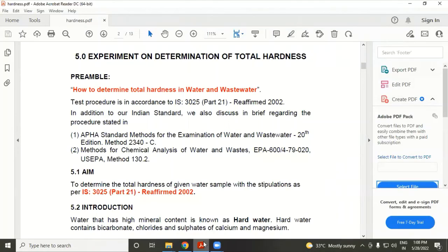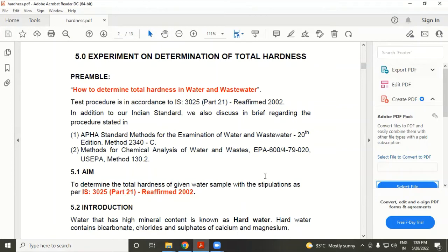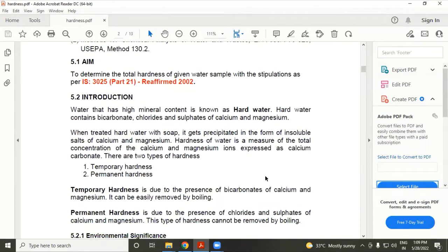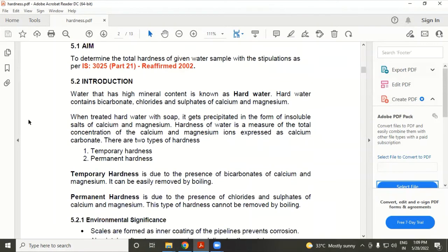Good afternoon students. Today we will discuss an experiment on determination of total hardness. The aim is to determine the total hardness of a given water sample as per IS 3025.